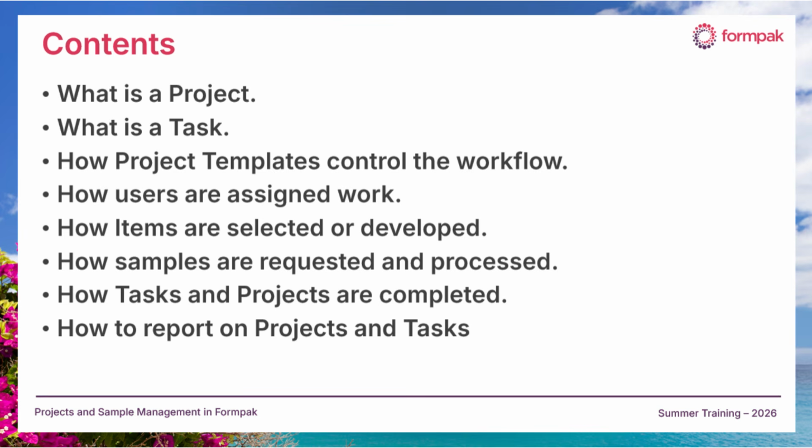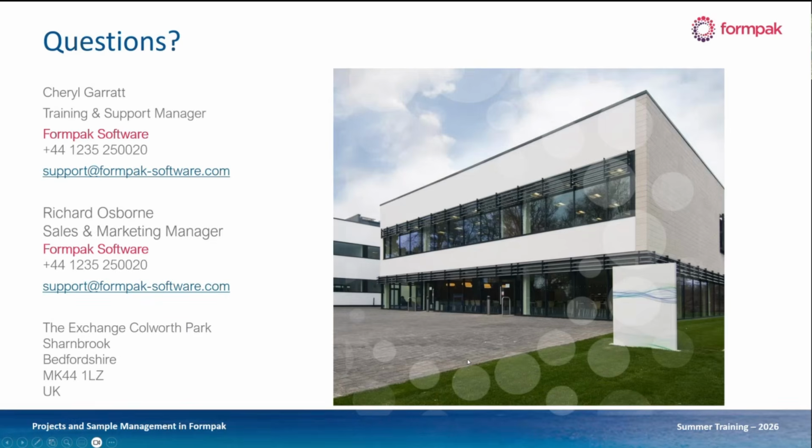So the key point to remember is that projects and tasks are fully configurable. Your system can be set up to have different project templates, task types, properties, status options or approval steps just to suit your business processes and requirements. So projects in Formpak can help teams organise and track their work in one place, can capture customer requirements and assign tasks to different users, manage the samples, monitor the progress, and it improves visibility and consistency across the workflow.